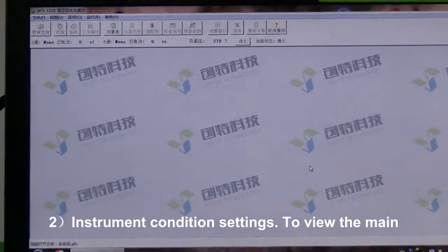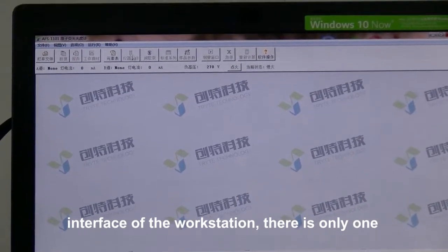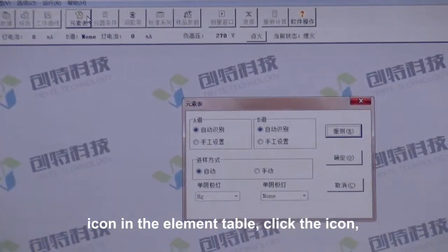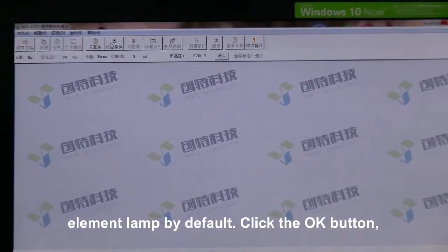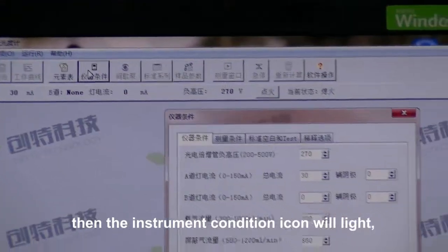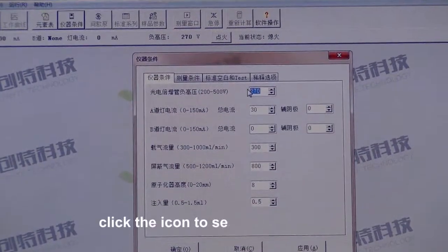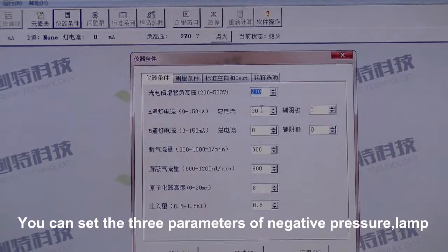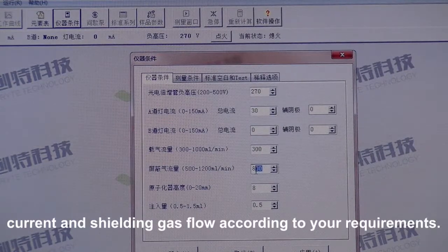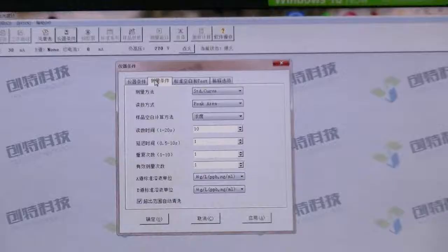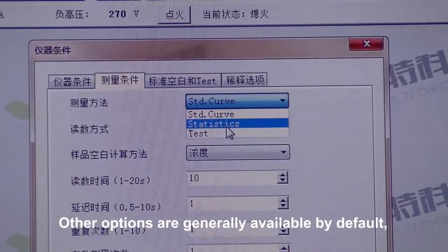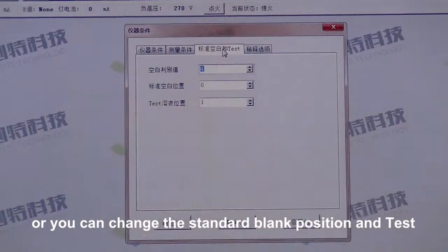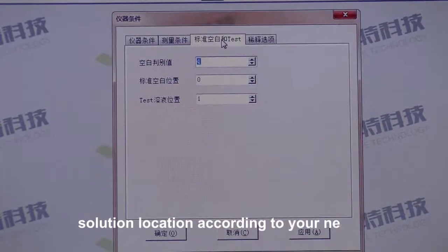Sub-step 2 — Instrument Condition Settings. To view the main interface of the workstation, there is only one icon in the element table. Click the icon, and the software will automatically recognize the category of the element lamp by default. Click the OK button, then the instrument condition icon will light. Click the icon to set test parameters. You can set the three parameters of negative pressure, lamp current, and shielding gas flow according to your requirements. Other options are generally available by default, or you can change the standard blank position and test solution location according to your needs.